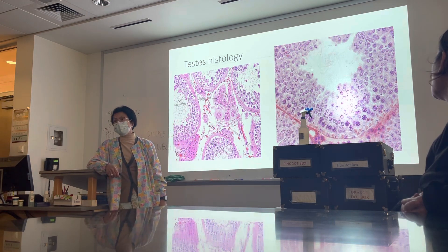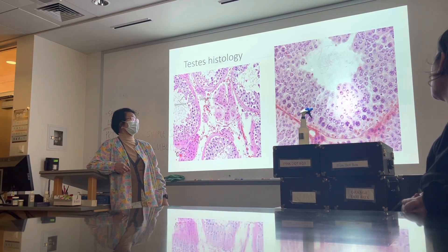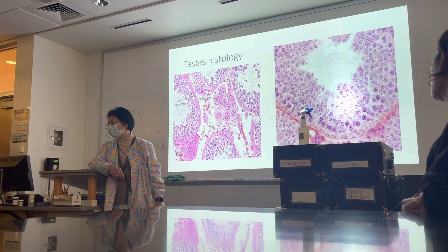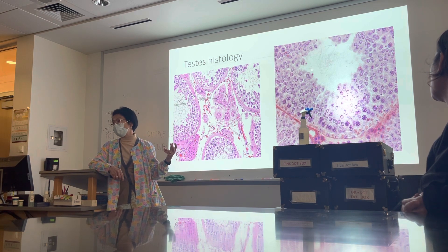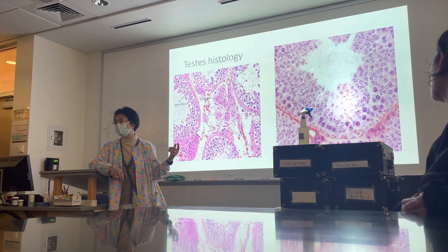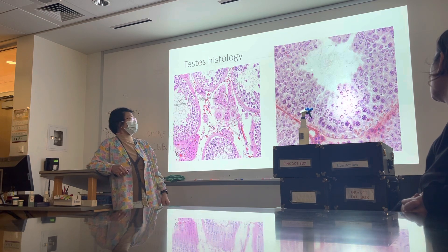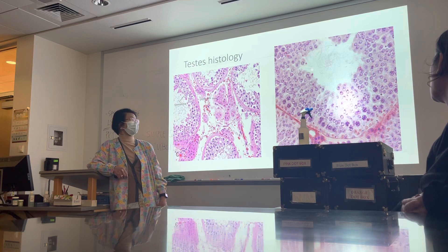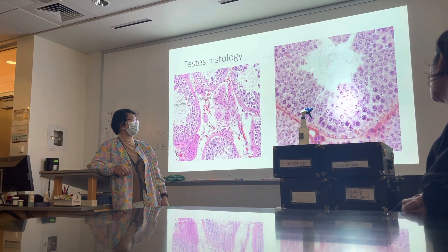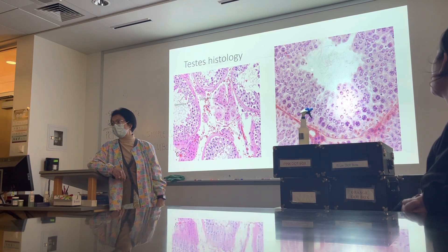In the lab exam, if the pointer is pointing there, you know the questions are related to the two cells in there — the sperm cells and the Sertoli cells. I am not going to ask you to identify the Sertoli cells because it's difficult. But maybe I'll point to these cells with the tail — you should know that those are sperm cells. Those are all your sperm cells, the spermatocytes undergoing meiosis.